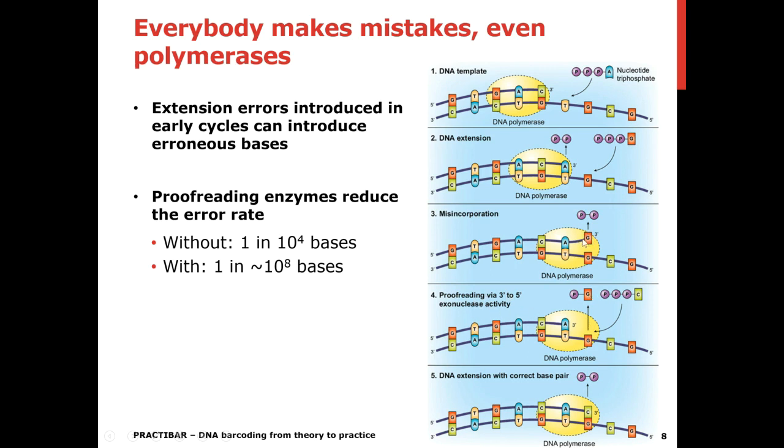So it can get rid of this G again, and then build in the right C. Polymerases from 5 years ago, which were proofreading enzymes and are still sold right now, are not called proofreading anymore because polymerases become better and better, and new polymerases come on the market every time. But they still are proofreading. Most of the enzymes are now proofreading enzymes.